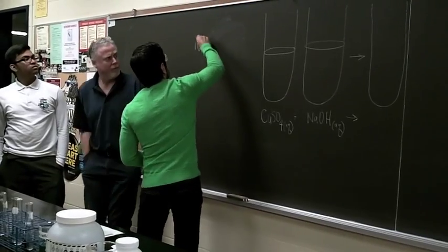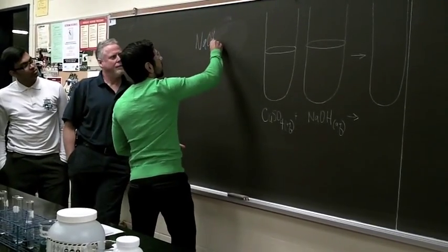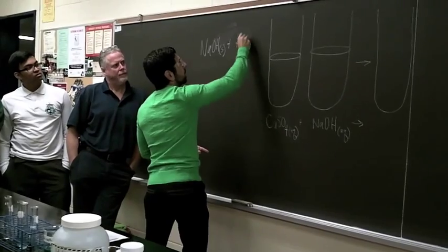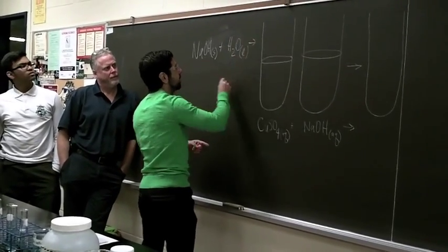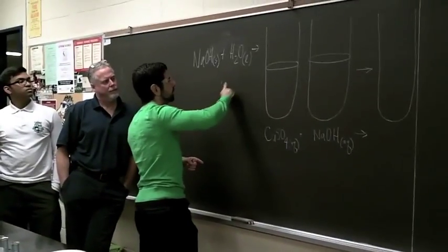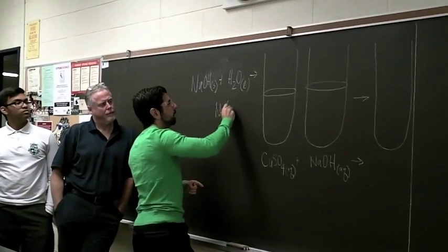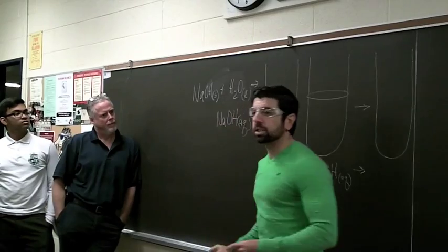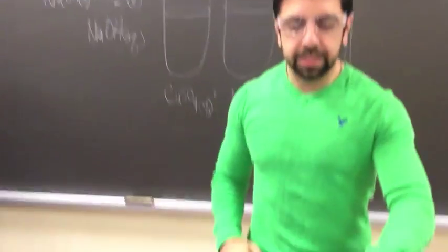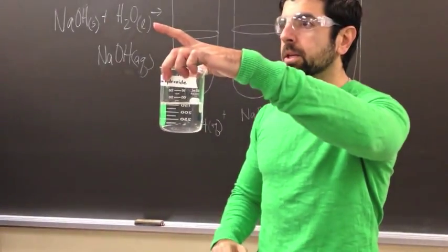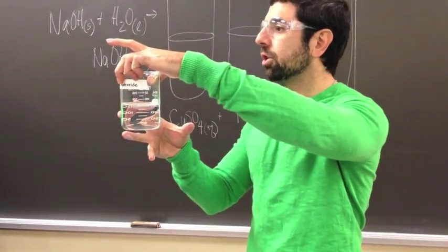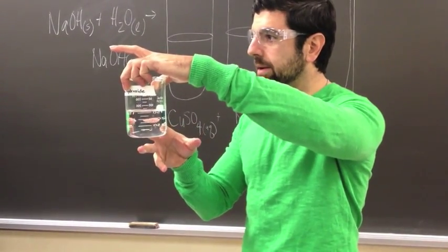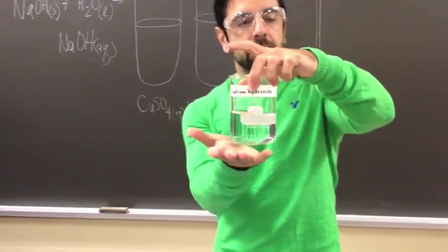Move this and put NaOH plus water as a liquid, that I actually form the NaOH aqueous, meaning it's dissolved in water. This is the aqueous solution. So I've got the pellets that I dissolved in water on Friday in this beaker.